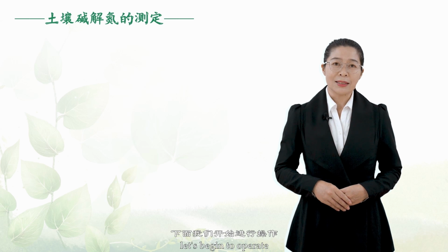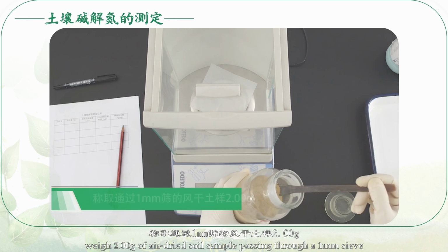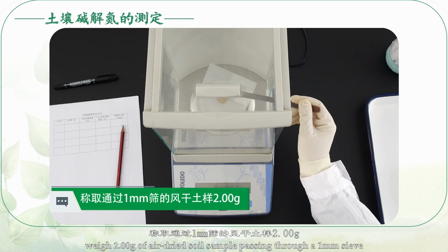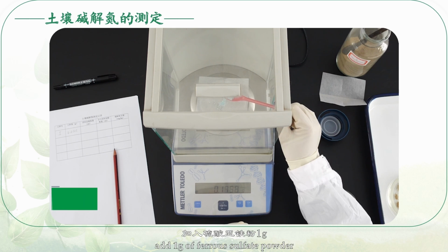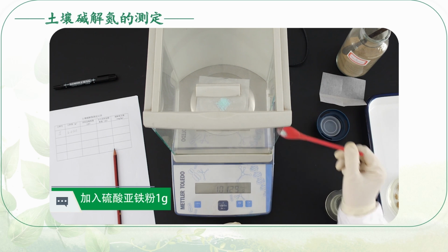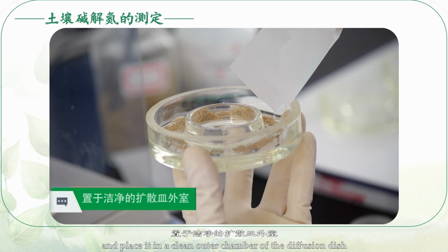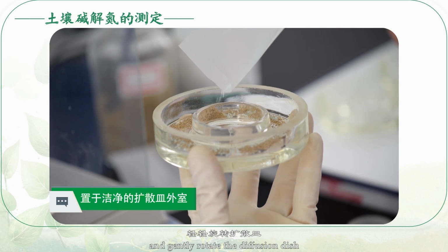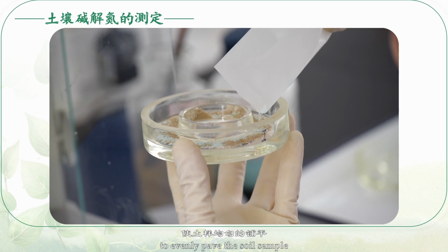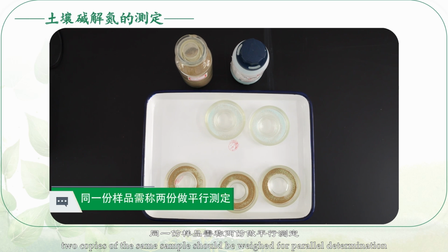Knowing the principle of measurement and having prepared instruments and appliances, let's begin to operate. Weigh samples. Weigh 2.0 grams of air-dried soil sample passing through a 1 millimeter sieve. Add 1 gram of ferrous sulfate powder. Mix evenly and place it in a clean outer chamber of the diffusion dish, and gently rotate the diffusion dish to evenly pave the soil sample. 2 copies of the same sample should be weighed for parallel determination.